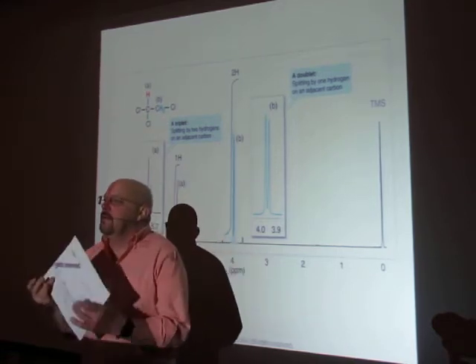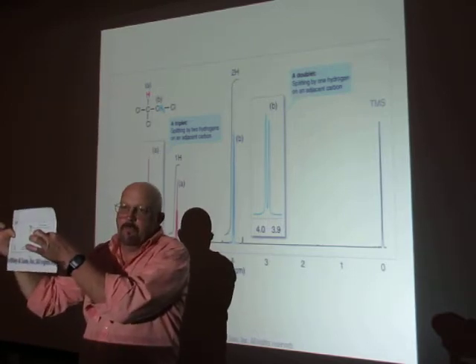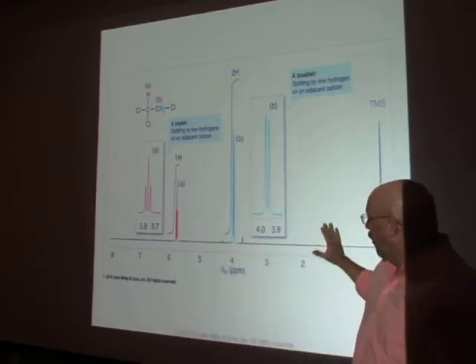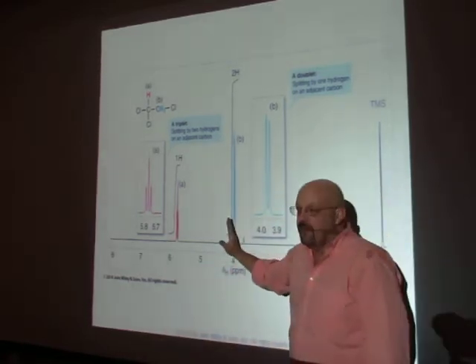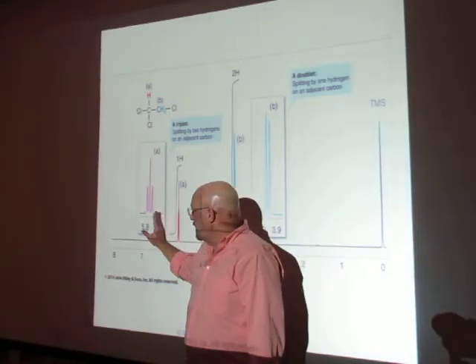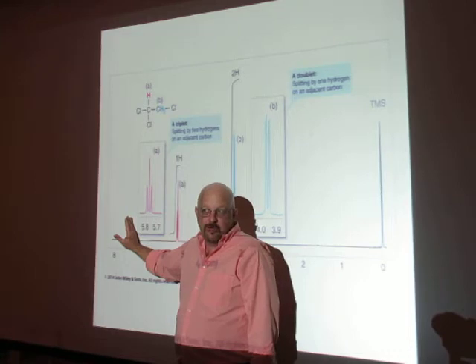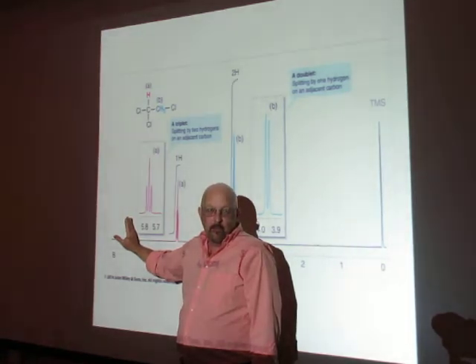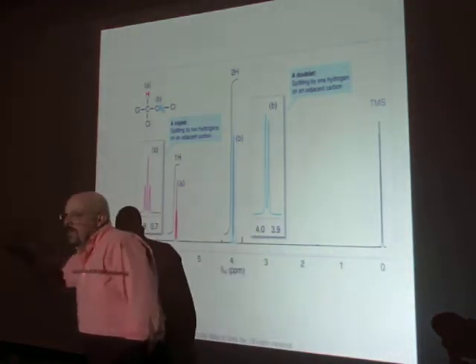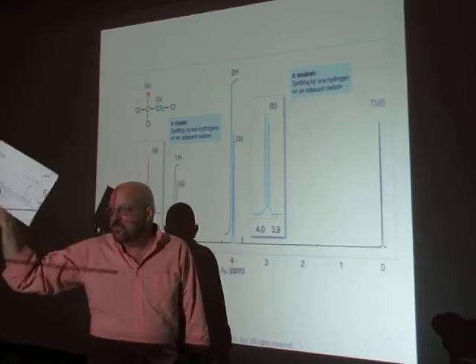So that's what I was trying to get over to you earlier. Don't get locked into thinking it has to be this. So on my chart, if 1 chlorine shifted me to here, 2 chlorines are going to shift me to here. If you've got 3, it's going to shift you even further. With 3 chlorines, actually, the proton comes at 7.24. So they get shifted even more. So don't get locked into thinking it has to be this. This is just a good starting point.